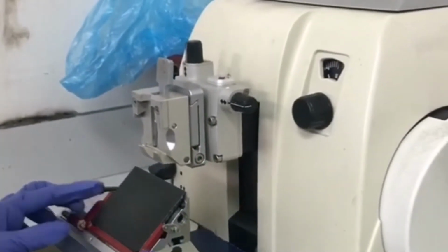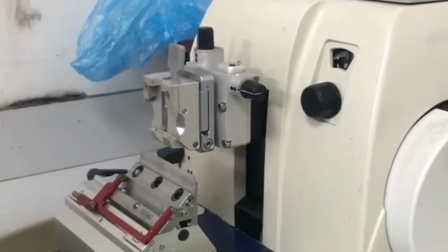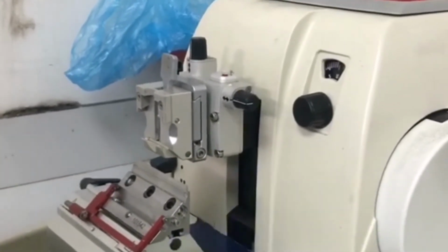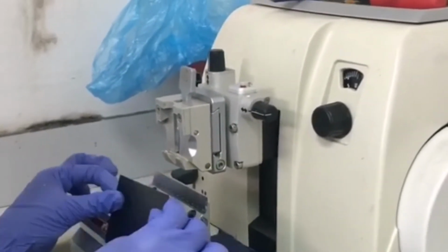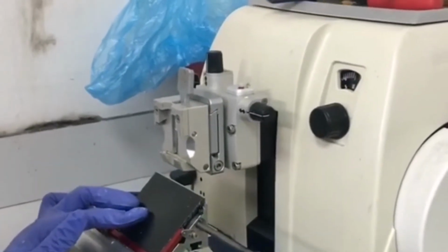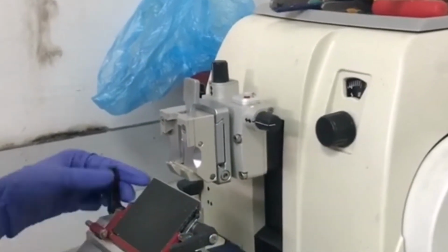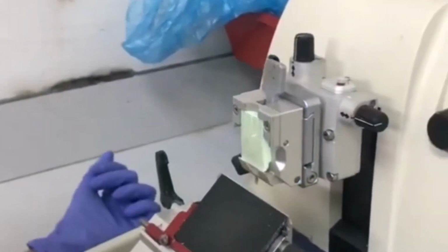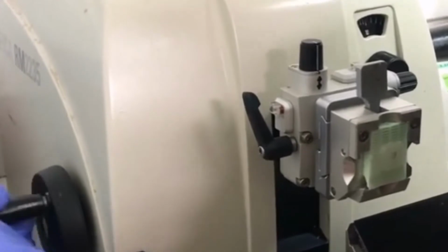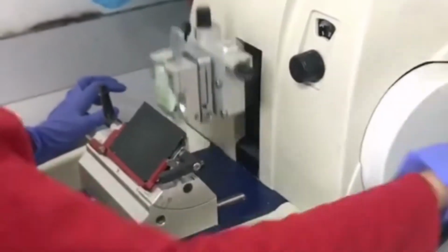For the first step of the sectioning part, dismantle the knife holder and insert a new disposable blade on the knife holder. Secure it properly. Next, place the cassette with the sample facing outward in the microtome. Secure it in a proper position. Then, release the lock and start sectioning it until it forms a ribbon on your specimen.